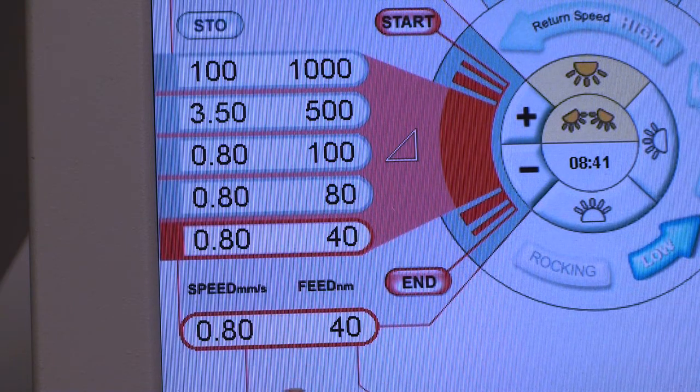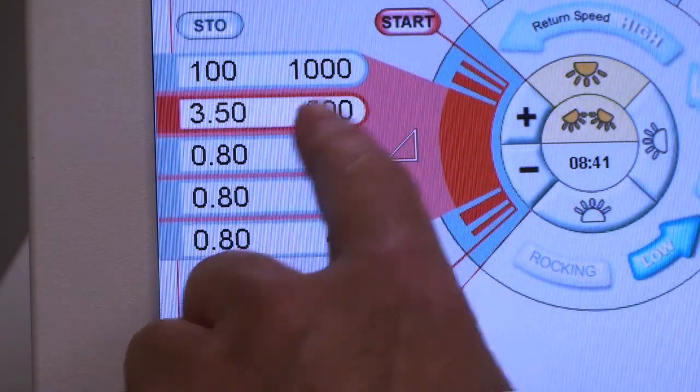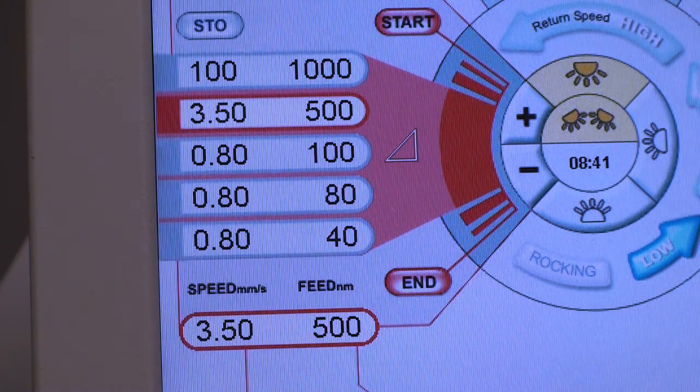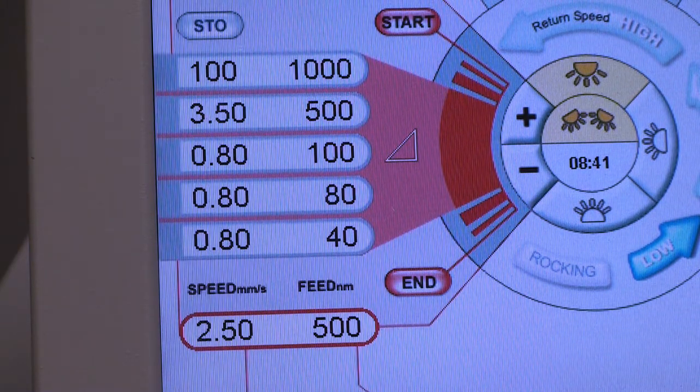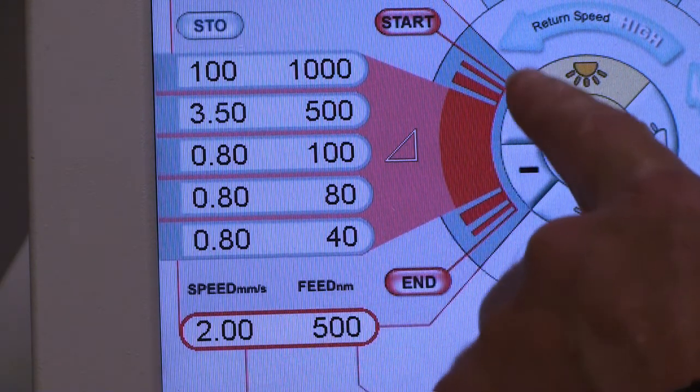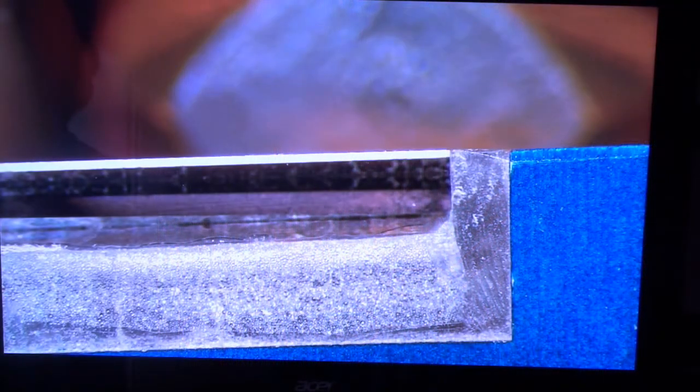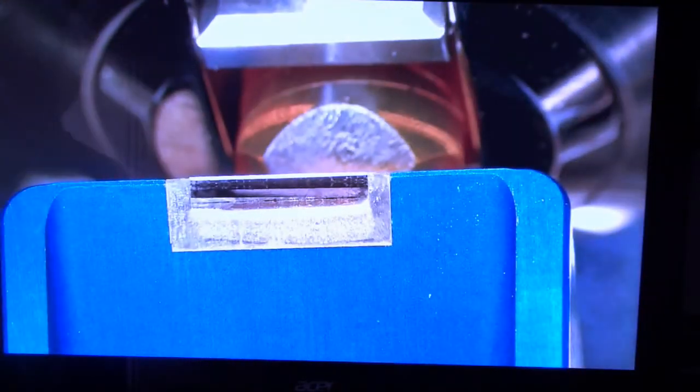And now I'm going to bring it down advancing it and I only needed to do a slight advance. I did two steps of 500 nanometers. So now I want to set up my thick sectioning parameters and I'm going to press on that and it says it's 3.5 millimeters per second at 500 nanometers thickness. I like two. That's up for your preferences. I've already adjusted my cutting window and so now I'm going to push start pretty soon.